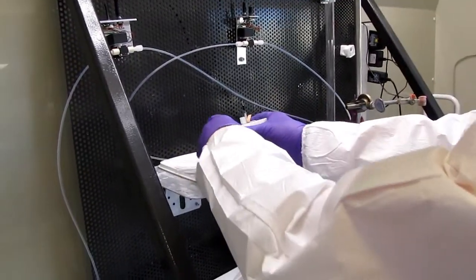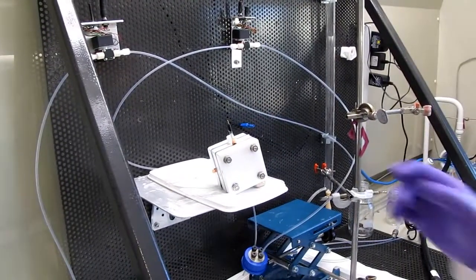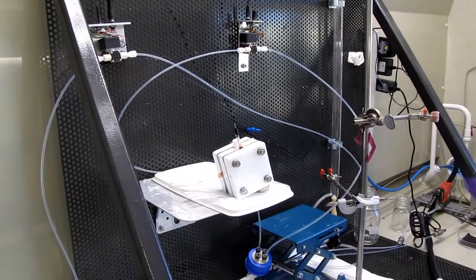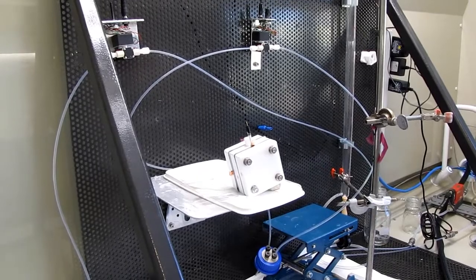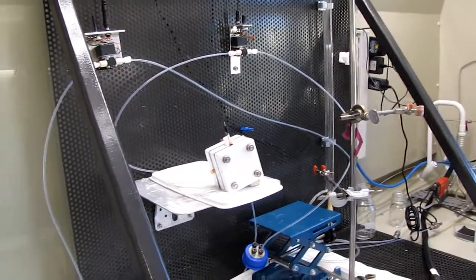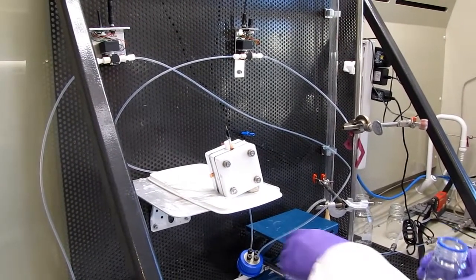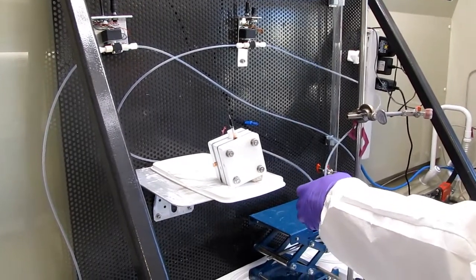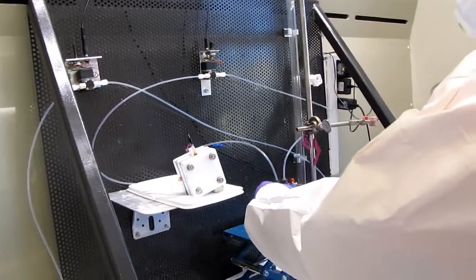And that's because of what? The contact. Making a sandwich structure is very difficult. Even a little bit of change in the gasket will cause leaking, and the spacing between makes bad contact. It's so fragile and difficult to run. This one I can do the same experiment like 3 times per day, at least, even more. So it's super quick.